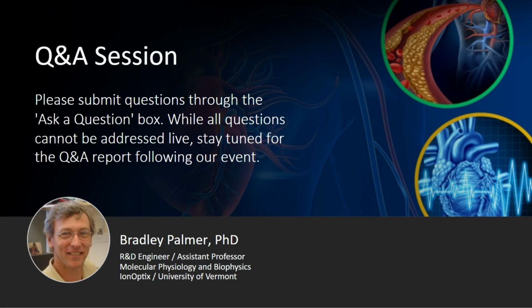I suspect it can be, although I've never tried it. You'll see that the right ventricle is already very thin compared to the left ventricle. But we have removed the right ventricle and stared at it and wondered if we couldn't give it a try. We just haven't given it a try yet. Like I said, it's very thin, and so we were afraid that it wouldn't be worth our while. It would be worth a try, though, because you can make sections as thin as 100 microns. And so I suspect you can make slices from the right ventricle.